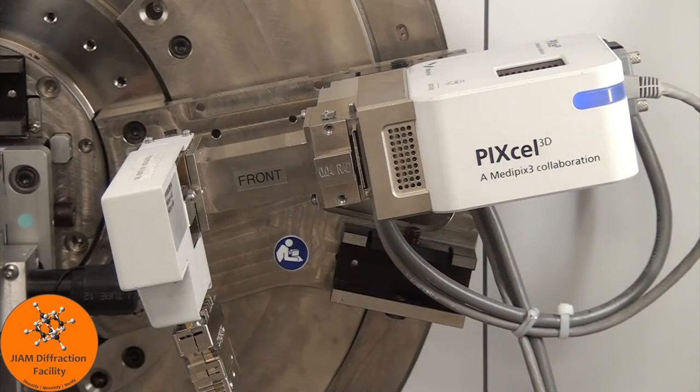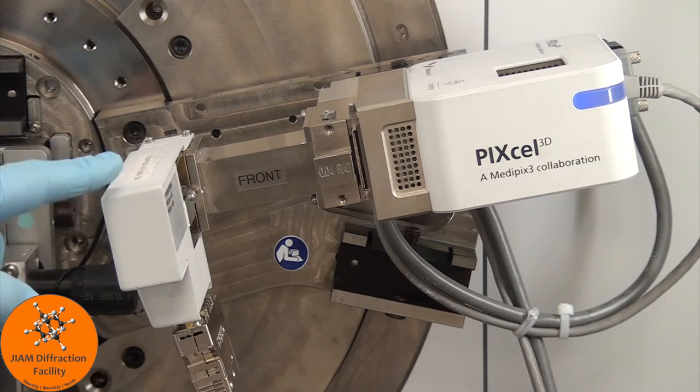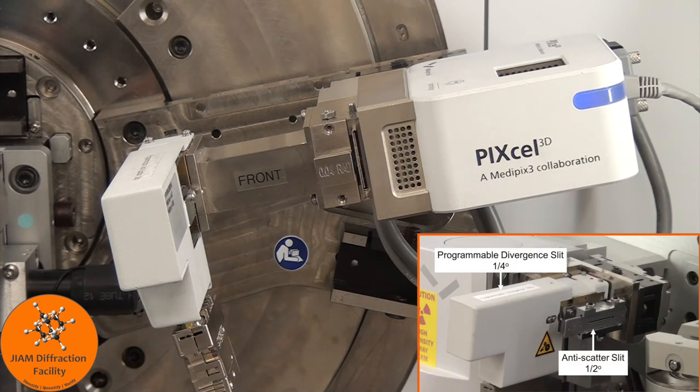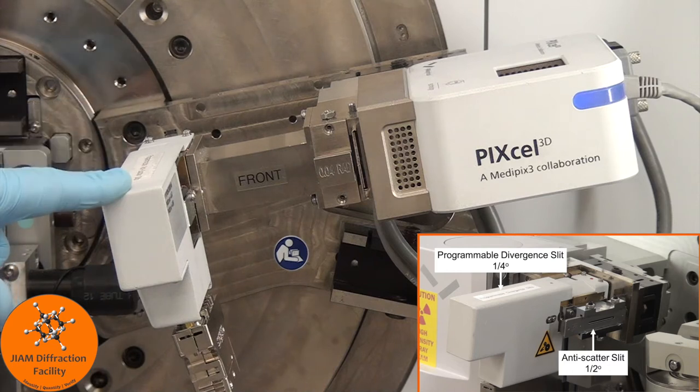Now let's look at the diffracted beam side. The first optic that the beam encounters is the programmable anti-scatter slit, and this is also the prefix module for this side. The programmable anti-scatter slit does the same thing that the anti-scatter slit does on the incident side. It cuts down on background due to scattering from air, but the size of this programmable anti-scatter slit needs to equal the programmable divergence slit from the other side. So if the programmable divergence slit equals 1/4, then the anti-scatter slit on the incident side needs to equal 1/2, and this should equal 1/4.